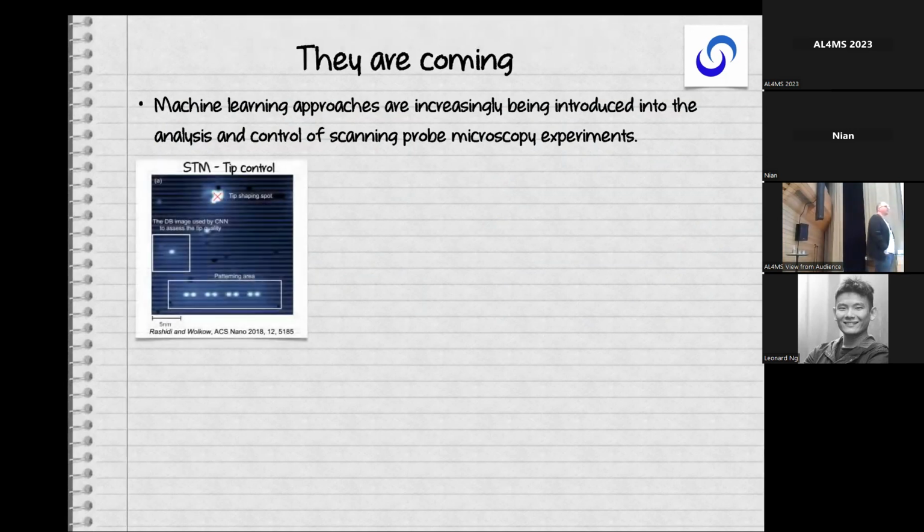I'm picking some examples which I like, maybe some of the earliest high resolution approaches coming from Bob Wolkow's group in Canada, where they have tip control. So they're trying to build molecular circuits using dangling bond wires on a hydrogen covered surface. So you remove hydrogen from a hydrogen covered silicon surface, you get dangling bonds, you can make wires, you can make circuits.